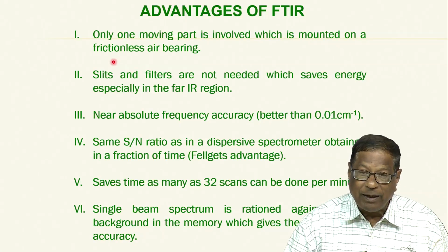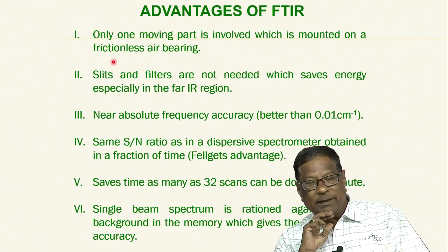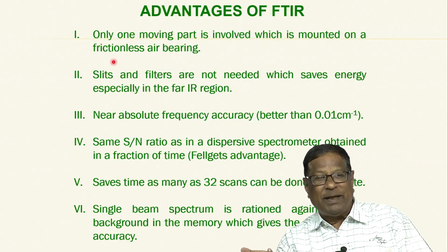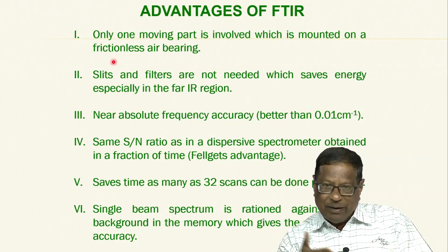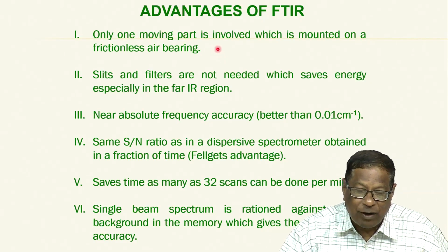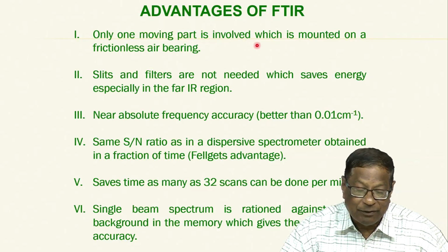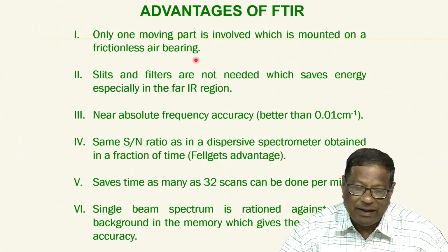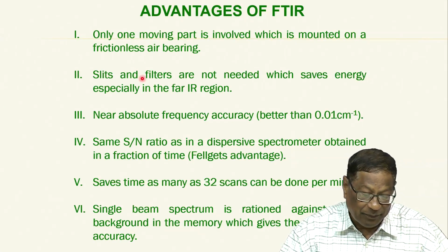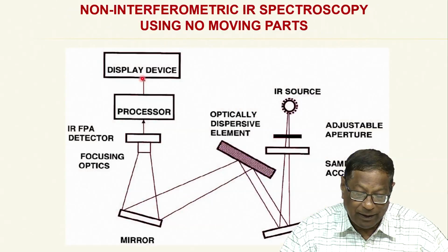So, what are the advantages of FTIR over the normal filter photometer or grating photometer? I have listed them here, and you can see there is only one moving part involved, which is mounted on a frictionless air bearing. For example, I am going back again a little bit.